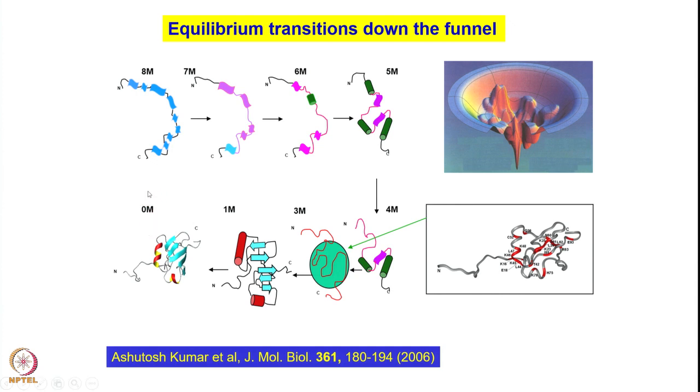So this is how you can monitor the residue-wise changes that are happening in any given protein.